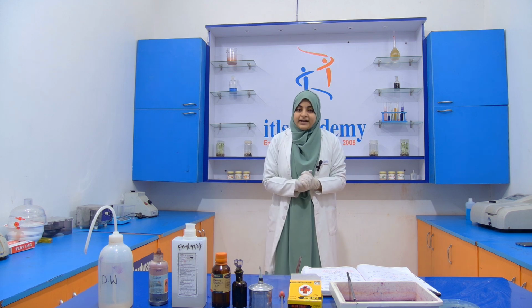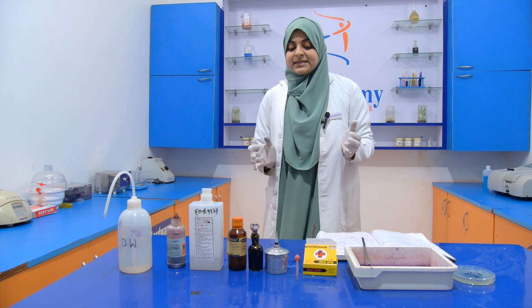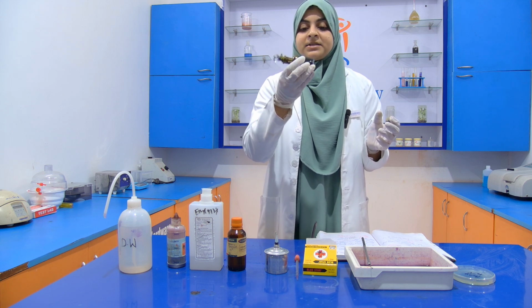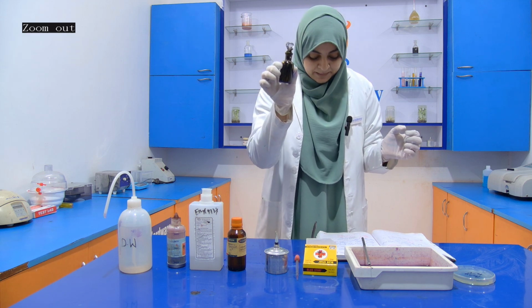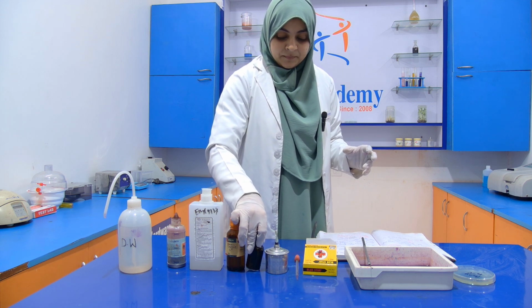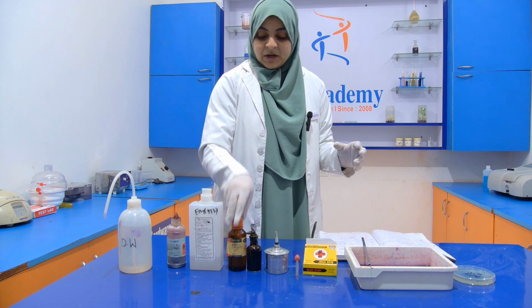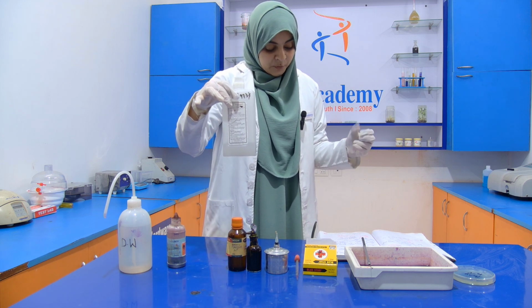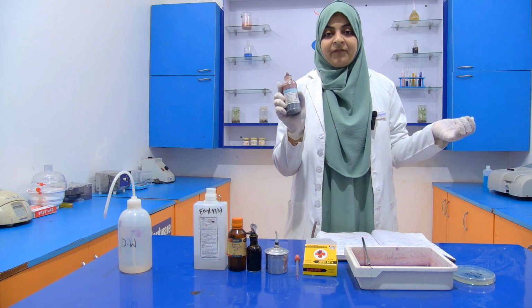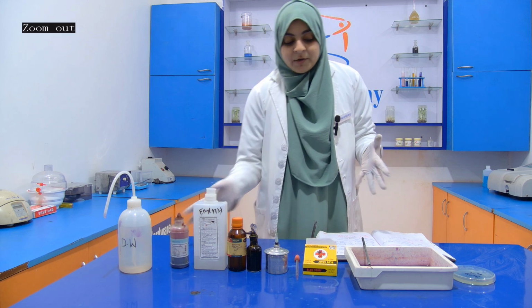Now come to the practical part. For performing this experiment, first of all we require crystal violet. This is our crystal violet. It is a primary stain. Then we require iodine, which is a mordant. Then we require ethanol, which is a decolorizer. Then at the end we require gram safranin, which is your secondary stain. Now what we have to do?